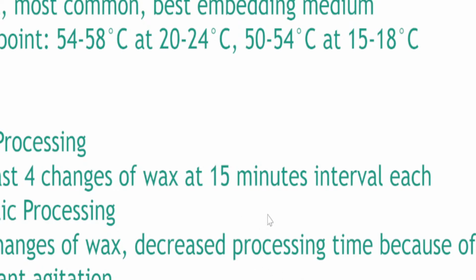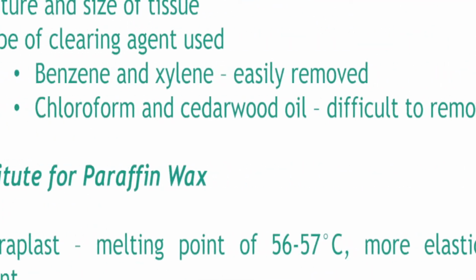Okay, so the Auto-Technicon has a swirler at the bottom, like those little magnetic tablets that spin around, that mix the sample. We could also use vacuum embedding, negative atmospheric pressure inside an embedding oven. So you could use that one as well.